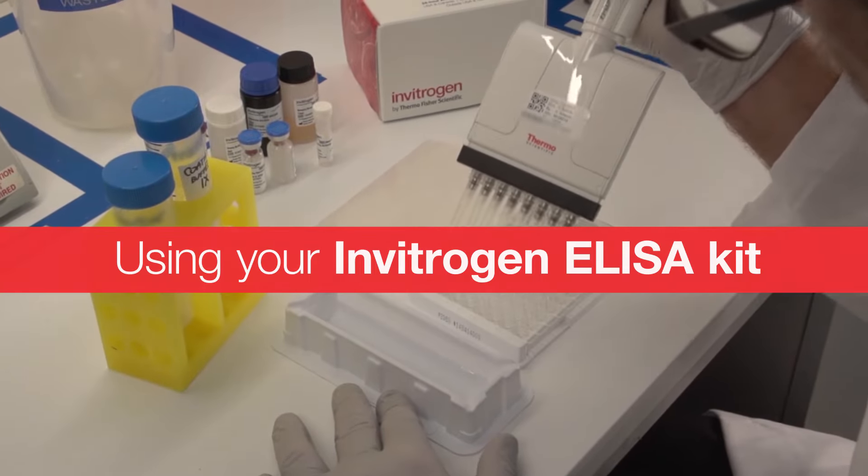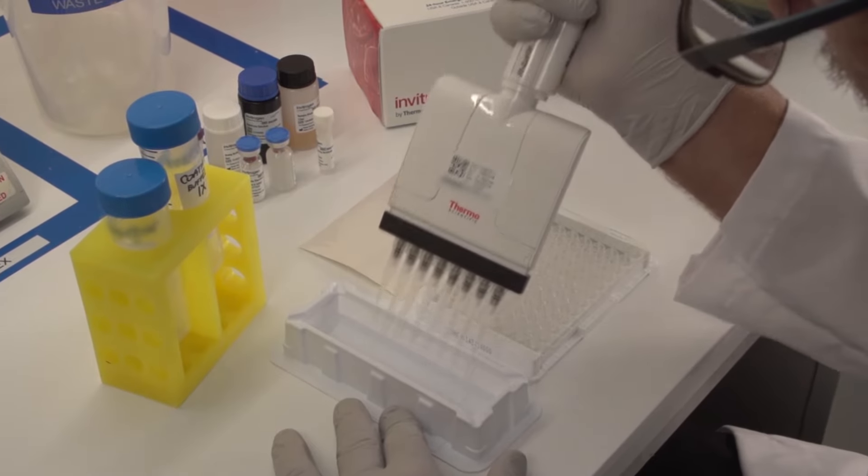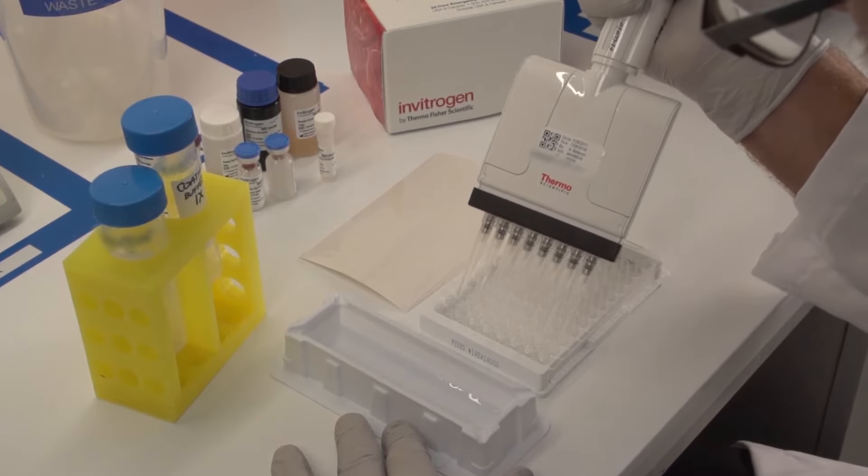Using your Invitrogen ELISA kit. In this video, we will show you how to use a typical ELISA kit.